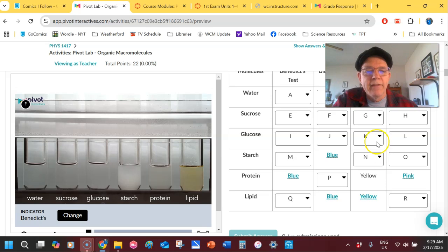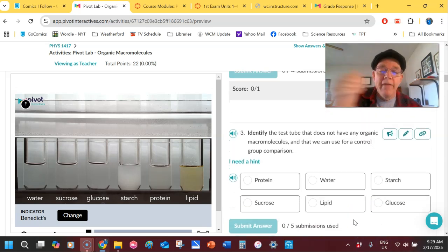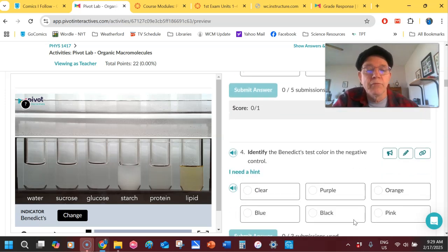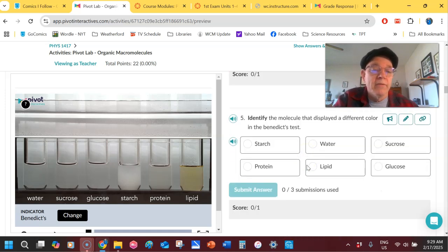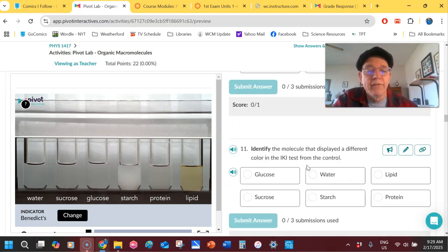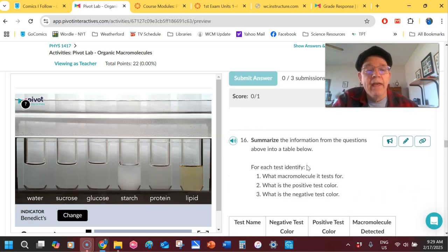You're going to go through for each test and put down what color they turn. All right. And then it's going to ask you which one didn't have any macronutrients, what was the color of the Benedict's in the negative, what color was it in the positive, and you get the gist. That's kind of what it's going to do for each of the tests, just so you can see what each of the tests look like as a positive or negative.